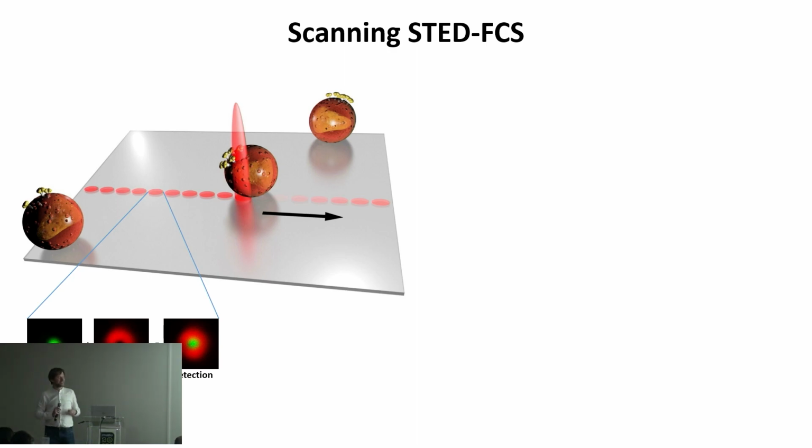However, this was not enough. We needed to extend the concept of STED FCS a little bit further to so-called scanning STED FCS. This is because, like I said before, there are only very few ENV molecules on the surface. You have about seven entities to label, which is a very limited amount of fluorophores that you can observe. And in FCS, if you point that excitation, especially in the STED regime, then you bleach everything immediately. So we needed a gentler approach.